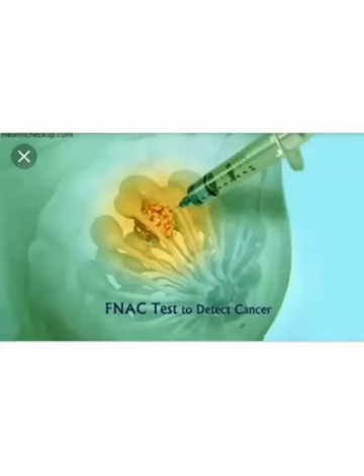Hello students, today I am going to deal with the spotter related to fine needle aspiration cytology. This is one among the cytology branches and is not like exfoliative cytology as you've seen in the Pap smear. Here we use the aspiration biopsy technique and specimen handling method. Fine needle aspiration is widely used for evaluating palpable superficial masses and cysts, as well as deep-seated non-palpable radiological abnormalities under image guidance.